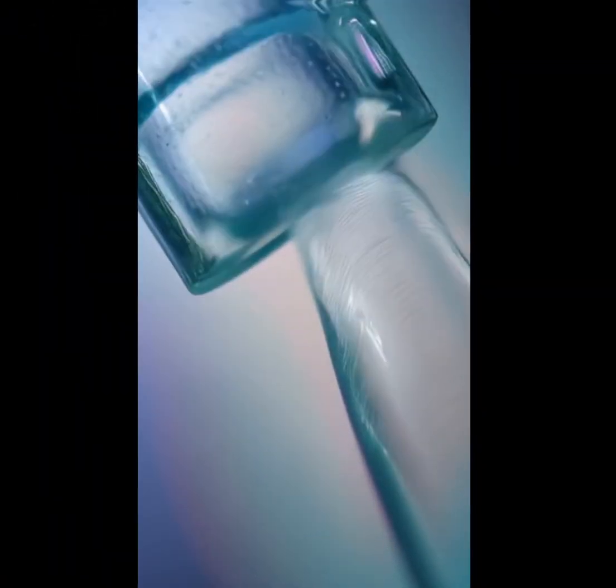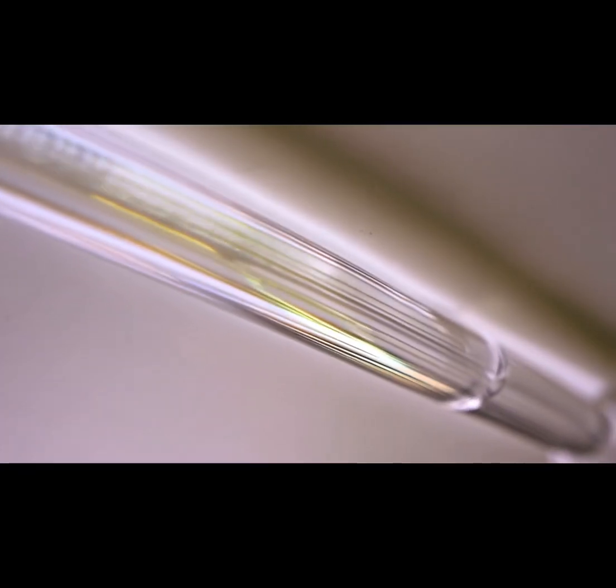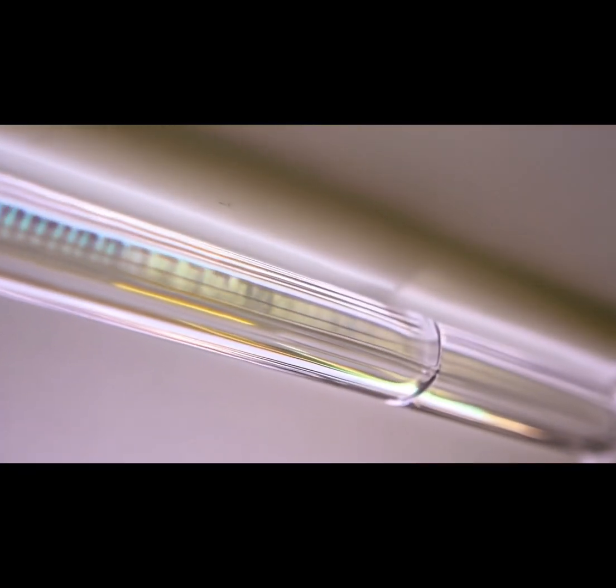Next, the negatively charged DNA fragments enter the capillary, which is filled with a polyacrylamide polymer and has a conductive buffer at both ends. The buffer enables an electric charge across the capillary, causing DNA fragments to migrate from the negatively charged cathode to the positively charged anode.